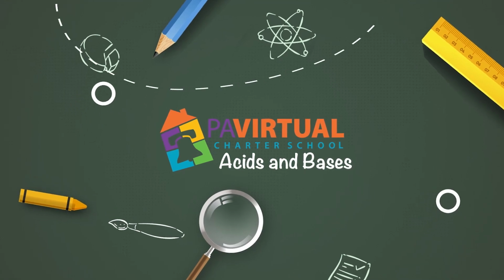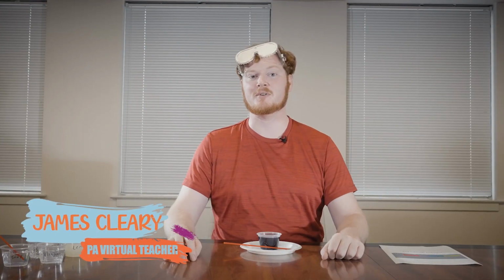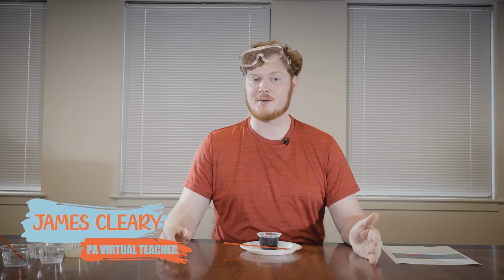Hello, I'm Mr. Cleary, and I'm a 7th grade science teacher at PA Virtual. And today I wanted to show you some experiments involving color and chemistry.